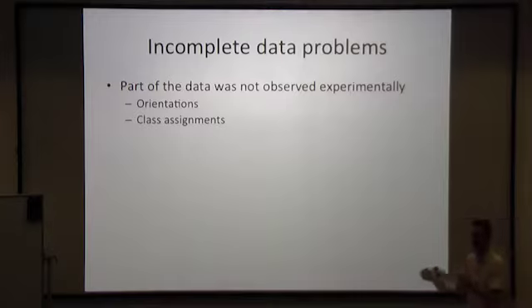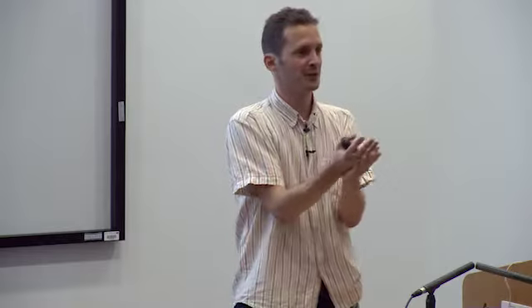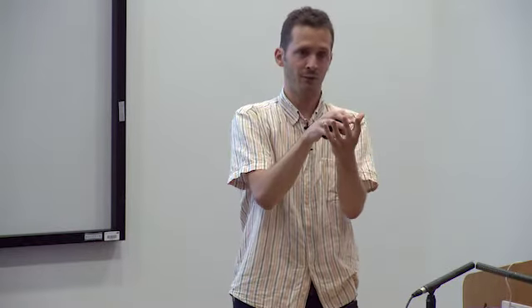And in this case, these are the orientations of all the individual images, of all the individual projections of Jan. Now, as structural biologists, we're not really interested in those orientations. What we're really interested in is the three-dimensional reconstruction of Jan. So they're kind of a nuisance: we paid £5 million for a microscope, and it doesn't even tell us what the relative orientations of all the images were.